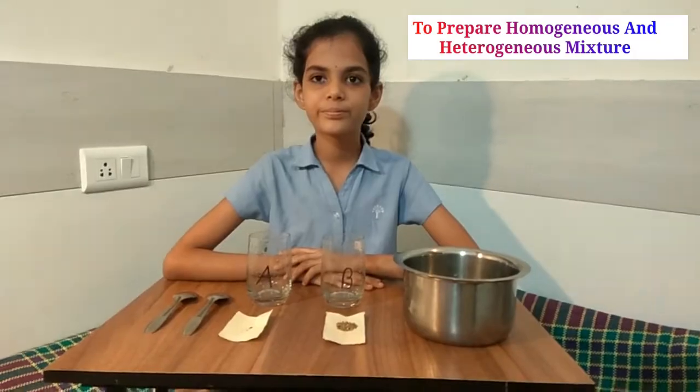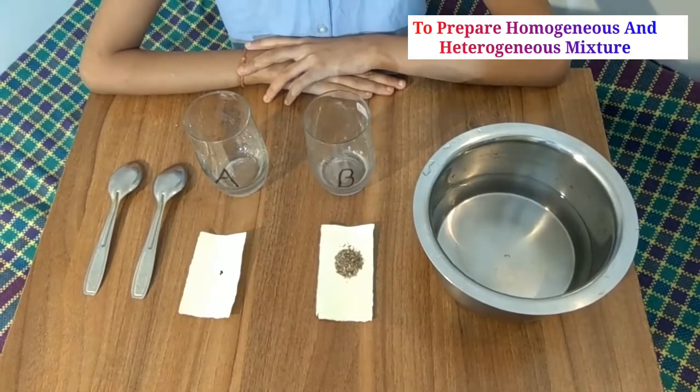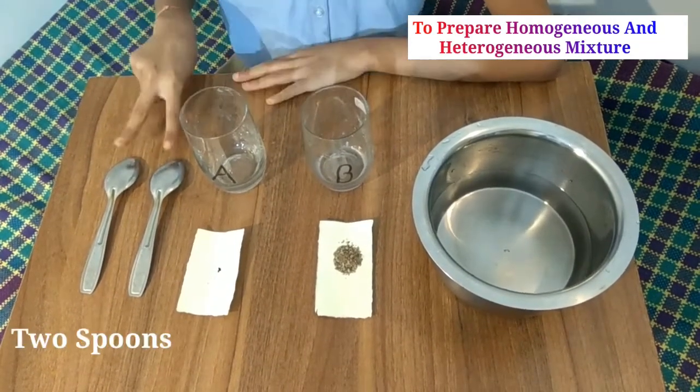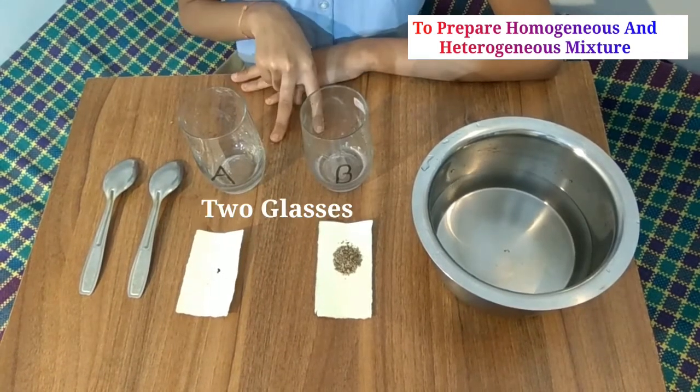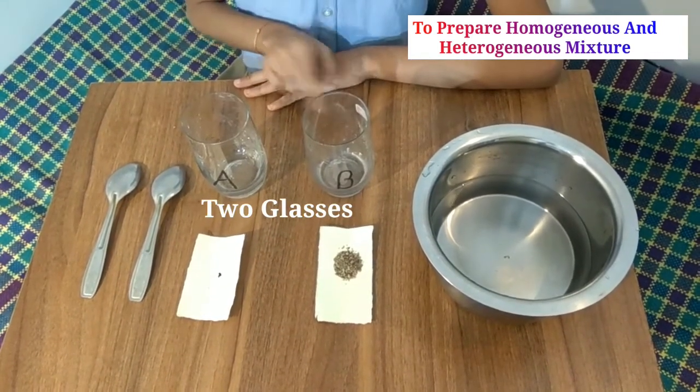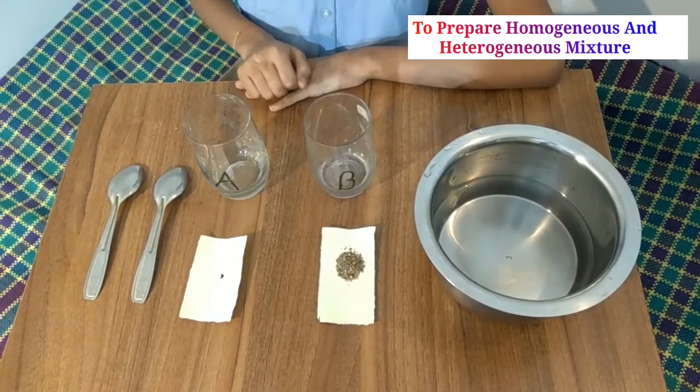Materials we need: two spoons, two glasses. Name the two glasses by A and B, potassium permanganate, sand, and water.